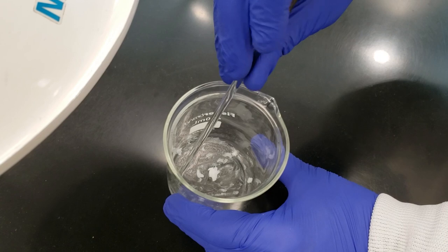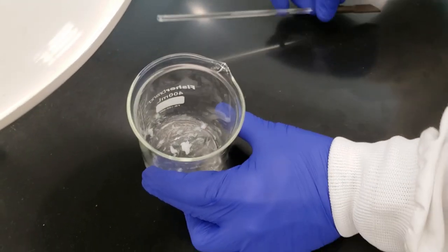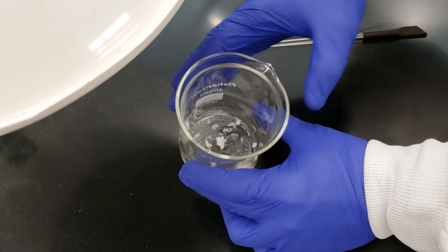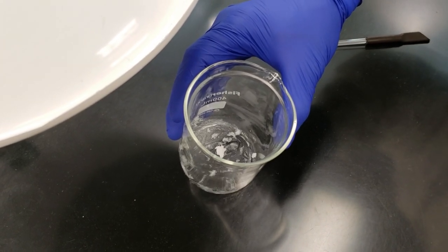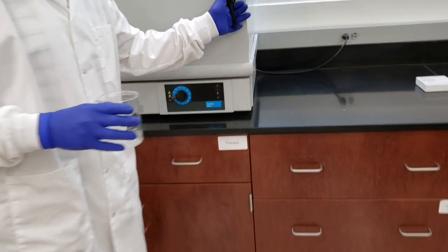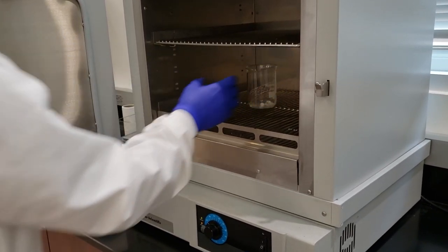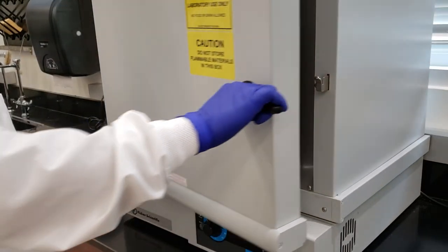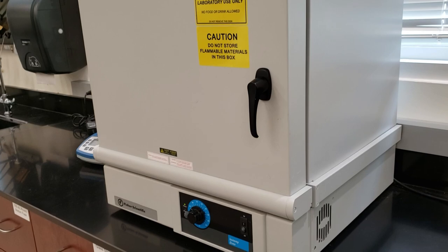Try and get as much off of the spatula tip as I can. Okay. So we'll place this beaker. This is pre-weighed, so we're going to place this into our drying oven, drive off any remaining ethyl acetate, and come back and weigh our final product. We've set the oven to about 85 degrees, which is above the boiling point of our ethyl acetate. Let's give it 5 to 10 minutes. We'll come back and check and see how the crystals are doing.